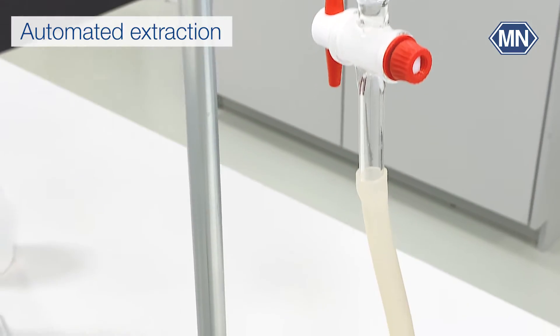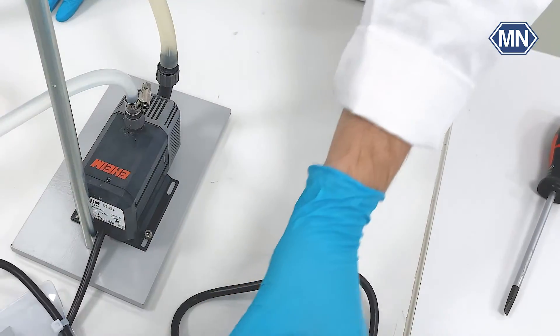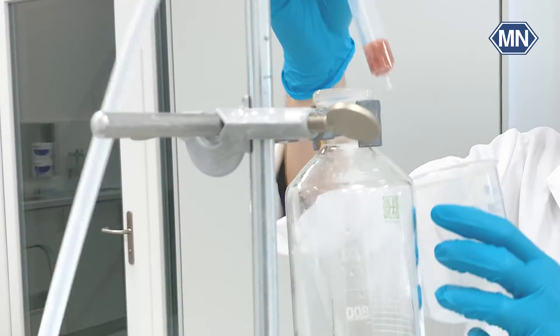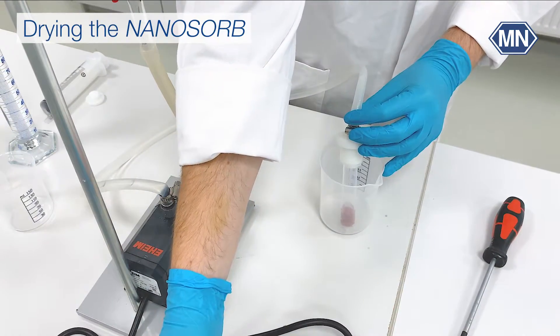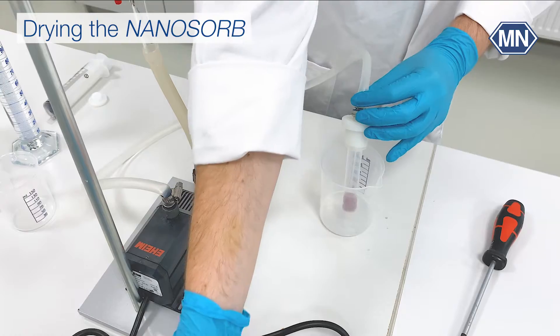After 20 minutes, the nanosorb just needs to be dried. Unplug the pump and empty the reservoir. Remove the adapter and hold the tube in the beaker. Turn the pump on to dry the nanosorb.